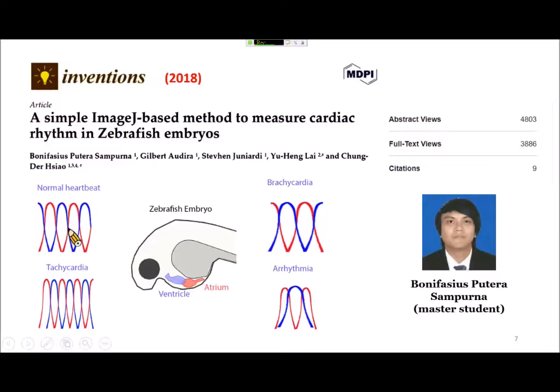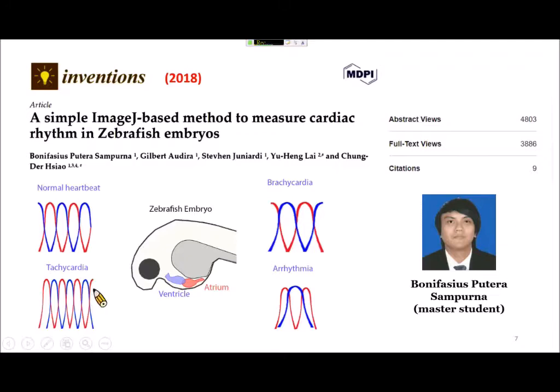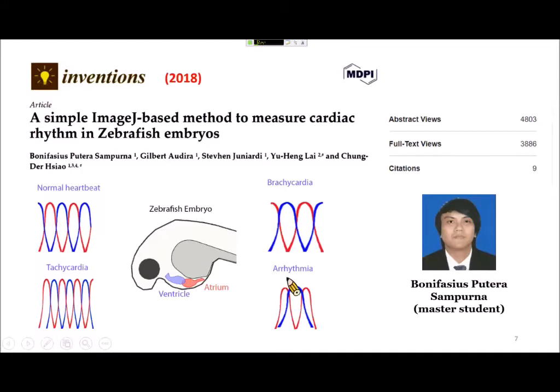The signal from atrium to ventricle is one-to-one. If the heartbeat gets faster, we call this tachycardia — you can see more peaks at specific timing, but the beating is still synchronous. If the cardiac beating slows down, we call this bradycardia. The worst case is arrhythmia, where the atrium-to-ventricle ratio is two-to-one, which we call irregularity of the heartbeat.